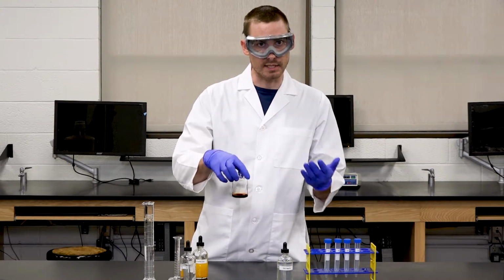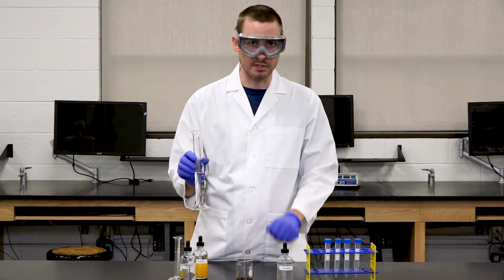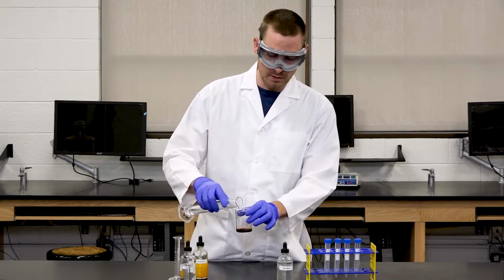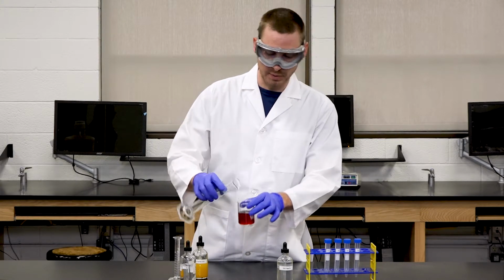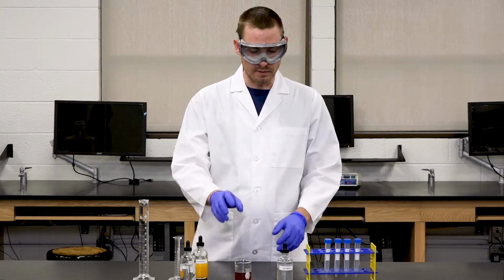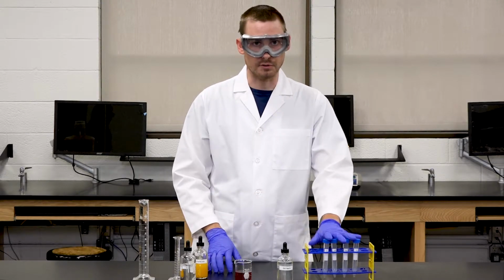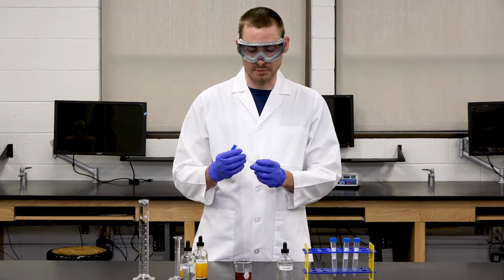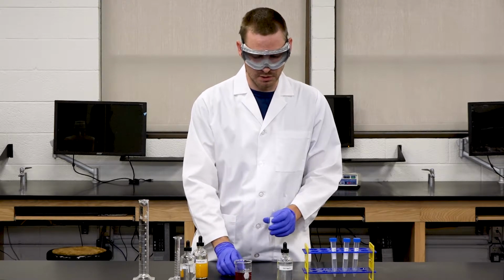So in order for us to see the color changes from the changes in equilibrium, we're going to add 50 to 60 milliliters of water to make this a little less dark, until we get a color that looks about like this. And then after we have made this solution and added the water, we will split up the solution into 4 test tubes individually. You can either use a graduated cylinder, or if your test tubes have gradations like these do, you can add 5 milliliters of solution to each.